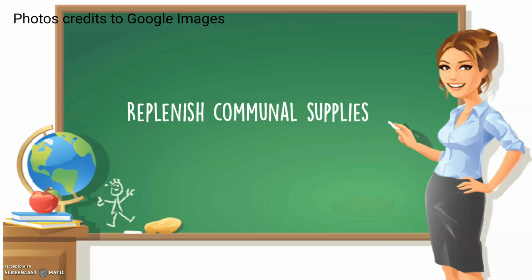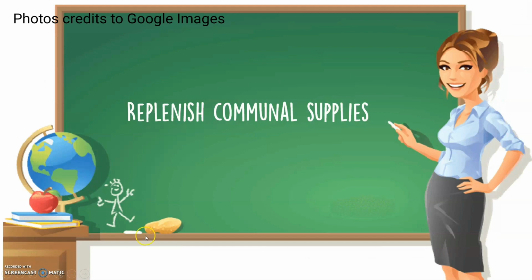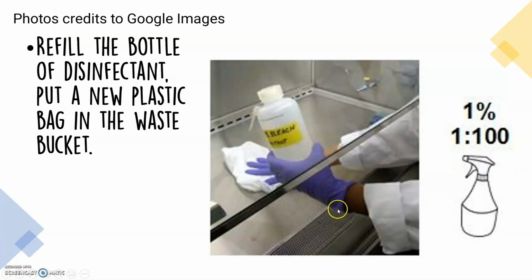Replenish communal supplies. In replenishing the communal supplies, you have to refill the bottle of disinfectant. You have to put a new plastic bag in the waste bucket.